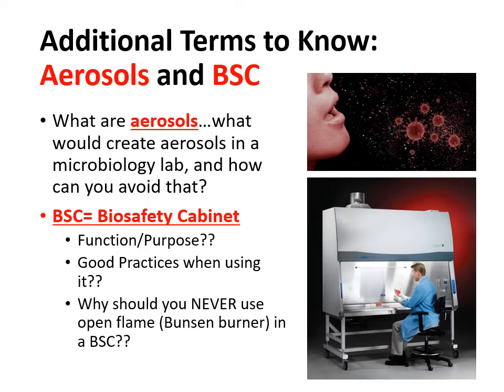The other term I want you to be familiar with is a BSC, which stands for Biosafety Cabinet, which you see in this picture right here. Now, a Biosafety Cabinet is basically a sterile workplace that helps to protect the worker, which you see here, as well as the rest of the lab environment from whatever you're working on. It also helps protect the experiment itself from what contamination may be in the environment as well.